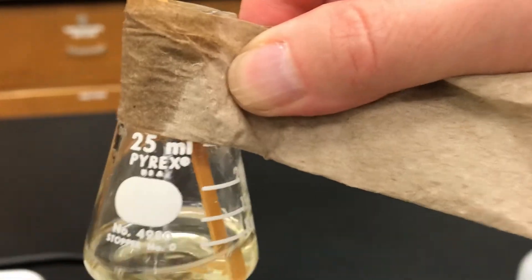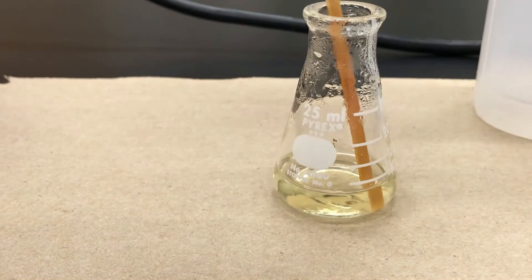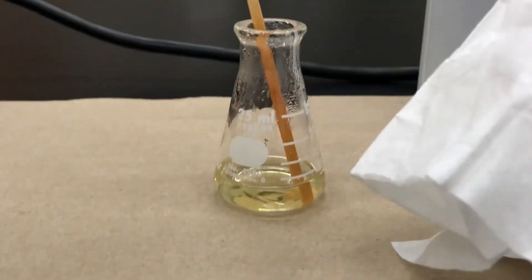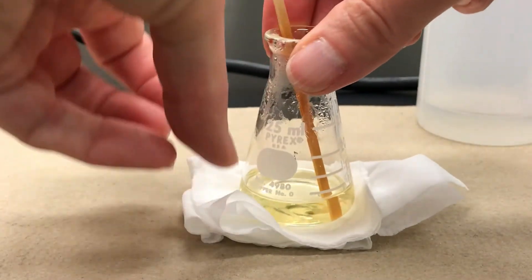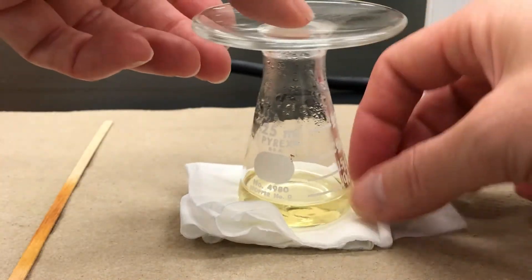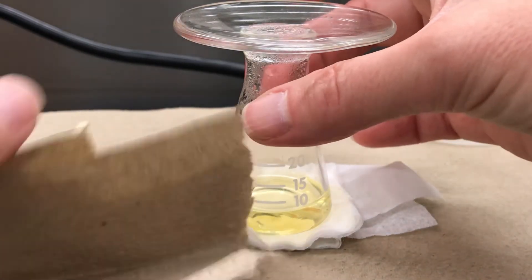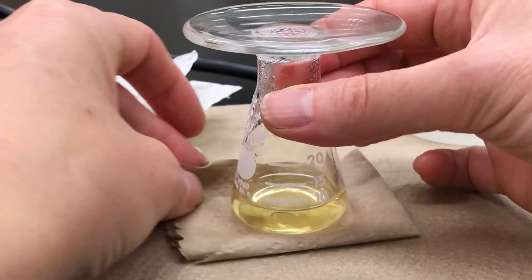Crystallization works best if you allow the solution to cool slowly. To help that along, you can set your solution on top of a few paper towels or folded kimwipes to insulate it from the counter. You can also remove the wood splint — we don't need that anymore — and put a watch glass over the top. Since I'm expecting a white solid, I switched to a folded paper towel background so we can see the white solid better.